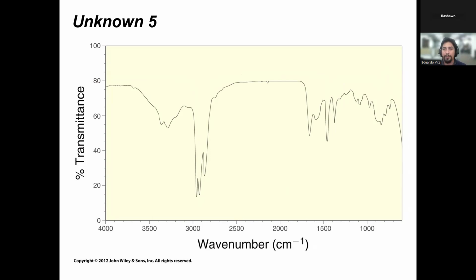So Zanaya, you asked me earlier, what are the steps to identifying? Simply look at the spectra and tell me what stands out to you. So in this case, you guys looked at the spectra. You saw there were some peaks at around 3,300. You saw there's two of them. You saw they're not very strong. They're a little bit broad as well. So you thought amine. What type of amine? How many peaks are there?